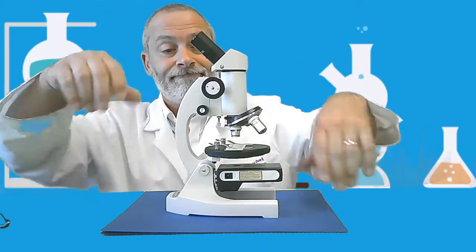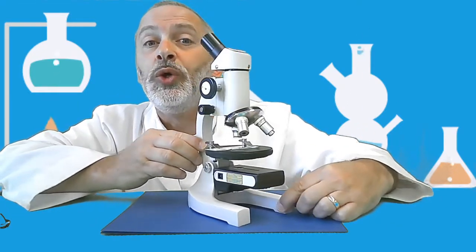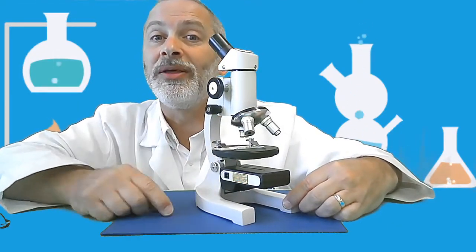All right. Notice the arm. The arm should face you when you are using the microscope.